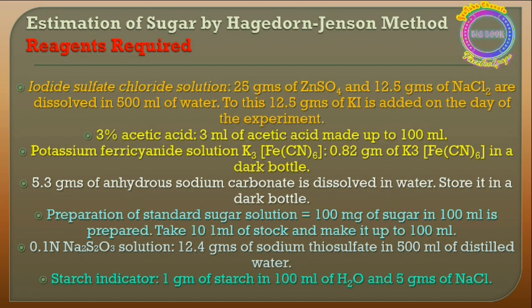Further is to prepare the potassium ferricyanide solution. We take 0.82 grams of potassium ferricyanide, and 5.3 grams of anhydrous sodium carbonate is dissolved in water. Store it in a dark bottle. So here we are going to prepare these solutions.